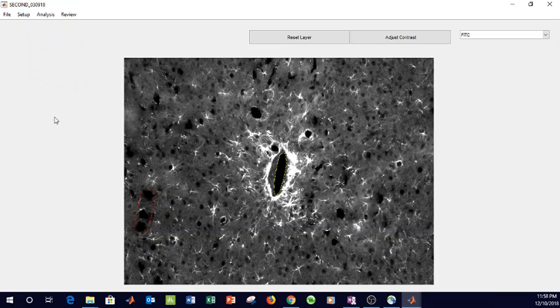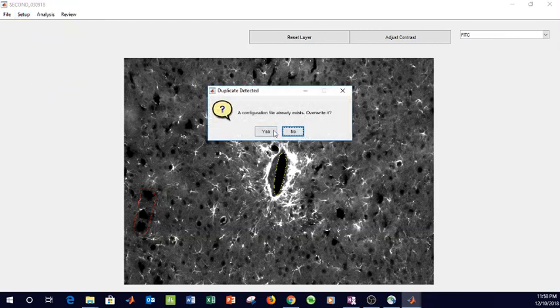I'm uploading a separate video that talks about an error that I ran into when I was trying to save. If your files are in a protected directory, like your C program files directory, you might get an error, which is a Windows write permission error. So it's probably best to make sure all of your files are in some user directory or the desktop so that the program has read and write access. Okay, so when you press Save Configuration, it's going to say that already exists because I already did that. Do you want to overwrite? Sure.